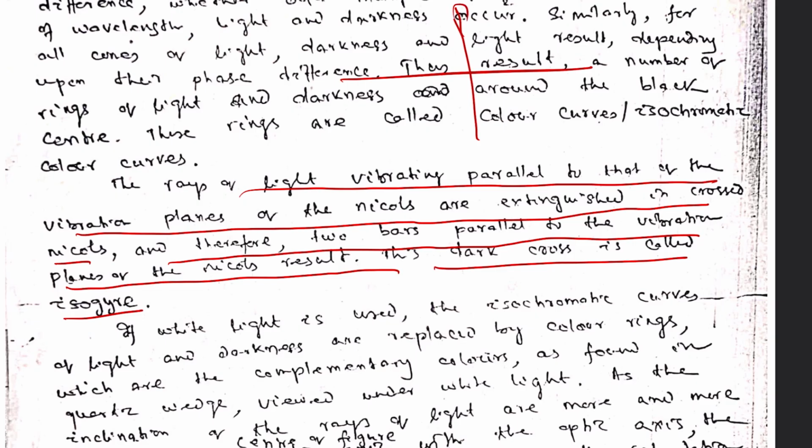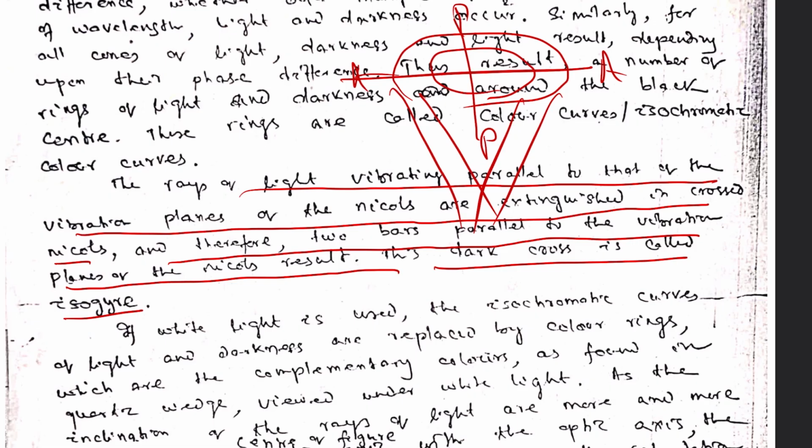This is the polarizer vibration direction, this is the analyzer vibration direction. And the rings of light rays are falling like this. The light rays coming on these rings, at these positions on the ring, the whole surface is illuminated by rings.